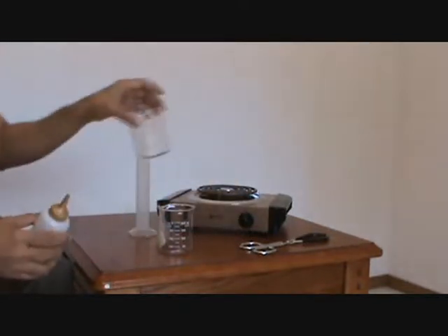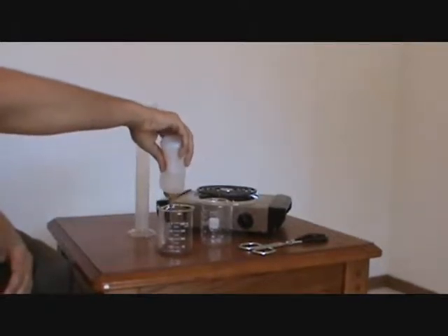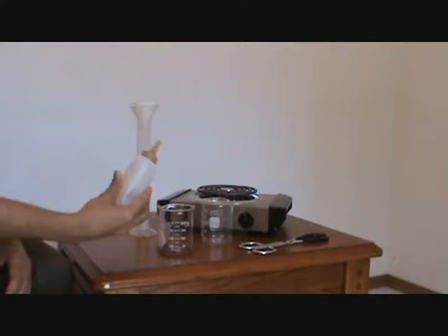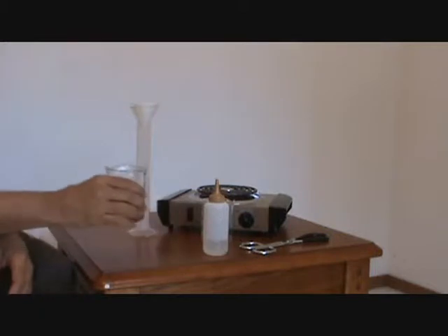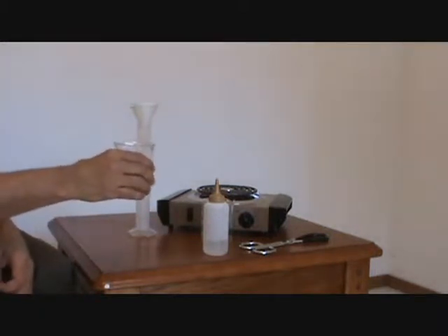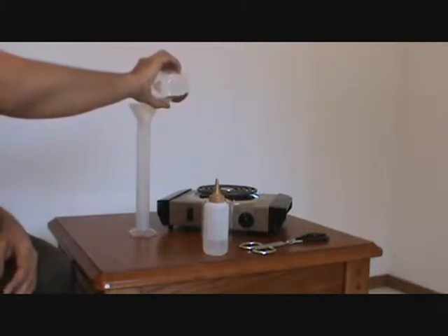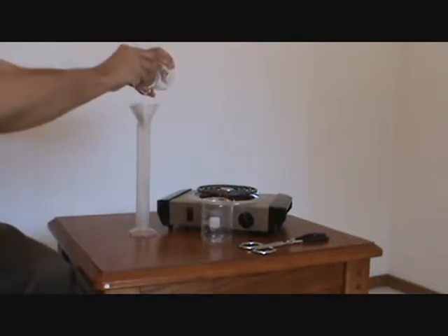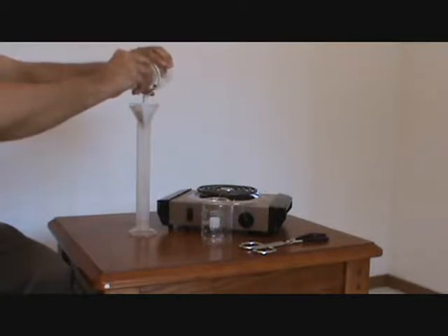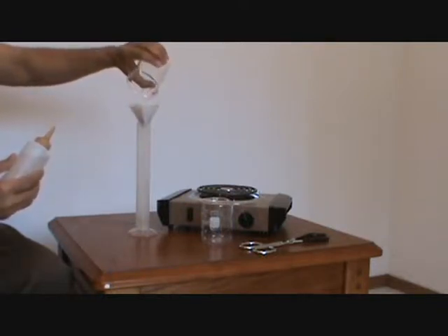I will now add about 10 mL of distilled water to the copper precipitate. I will now swirl the contents and pour the contents into the filter paper. I will now use a wash bottle to rinse any residue of copper into the funnel.